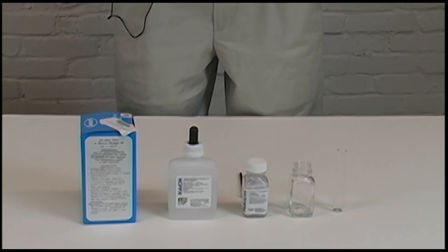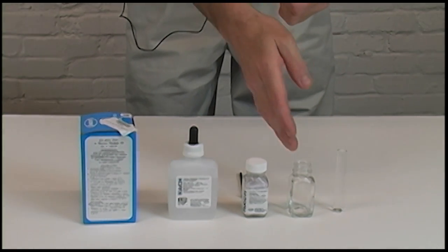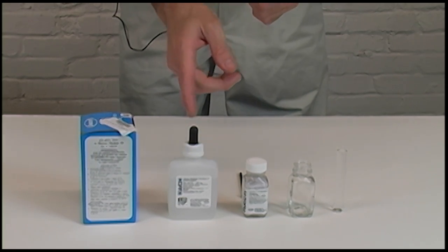Everything that's needed for testing the hardness of your water comes all in one kit. It comes with your measured vial, your mixing vial, your hardness agent, and your titrant solution.